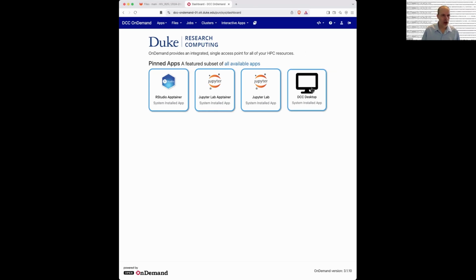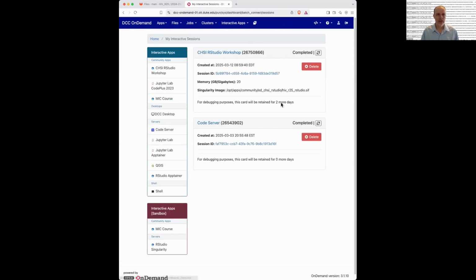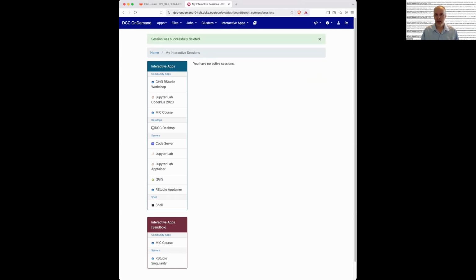Okay, so if you are here, I think I can click on here, the all available apps. You can also click on right here. Oh, no, that's confusing. I'm going to click there. I'm just going to get rid of those things.